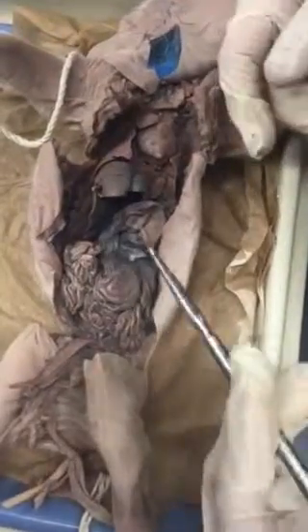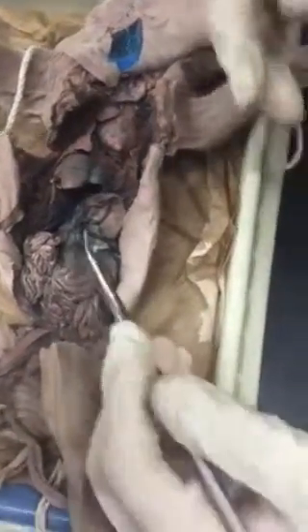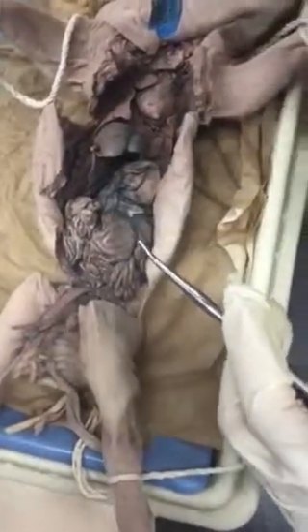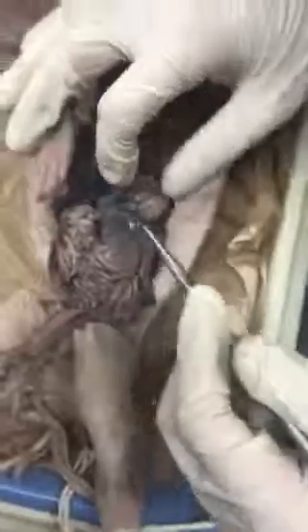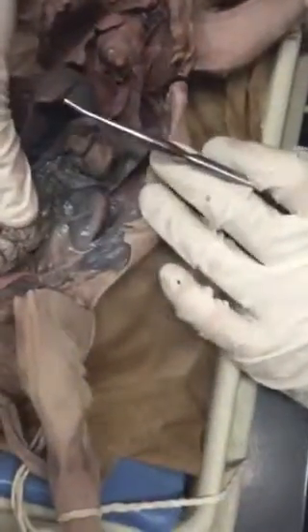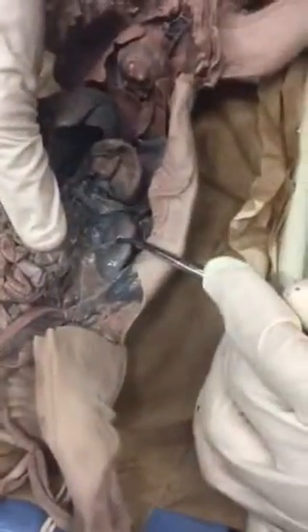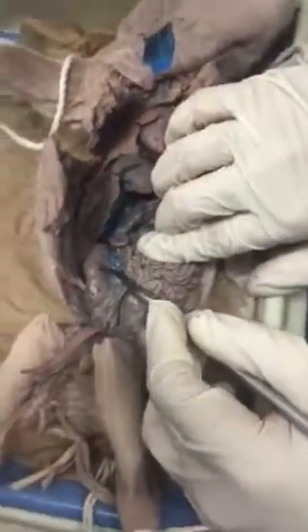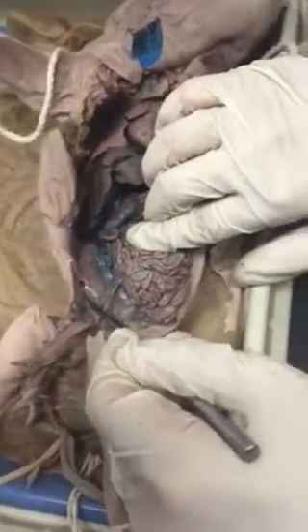The mesentery serves the purpose to coil the intestines, so as to increase surface area, through folding. Yeah, that's the thing. Okay, and when we move the intestines out to the side, and on both sides you'll see this and this, and these are the kidneys of the pig.